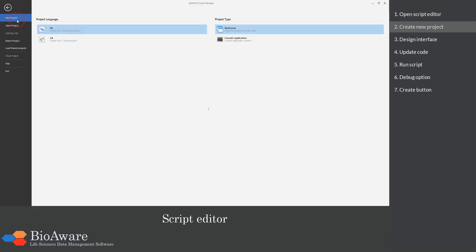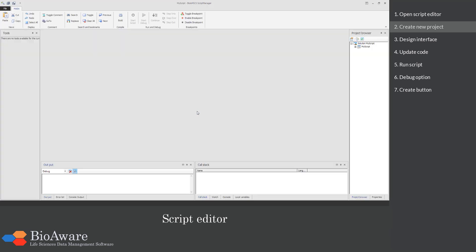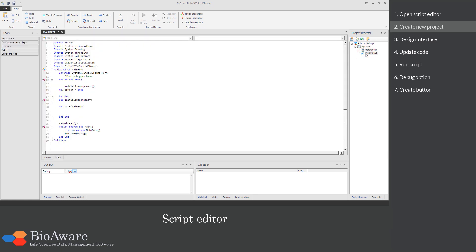In this example we will create a new script or project in Visual Basic. Enter the name of the new project and click OK. Then in the Project Browser section double click on the script name .vb to open the project.